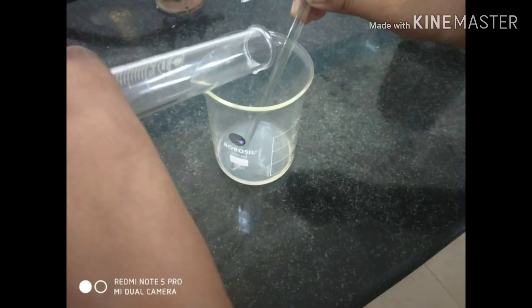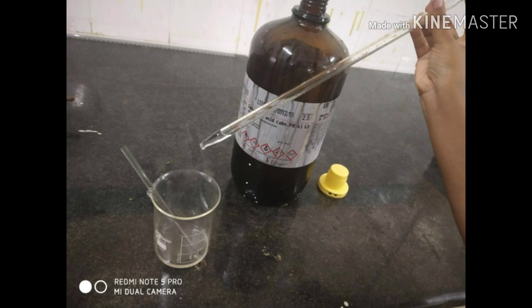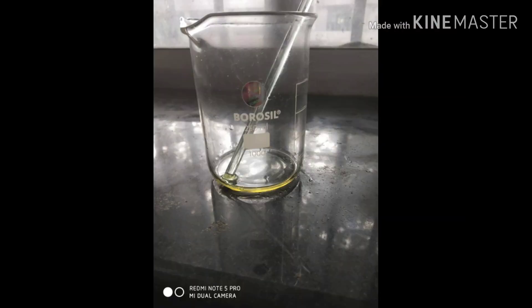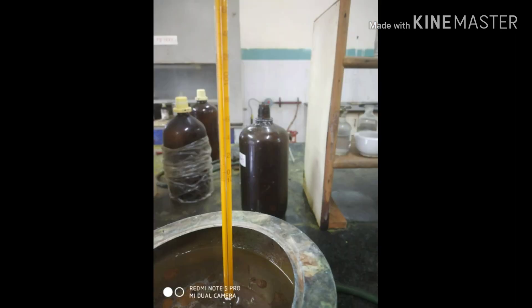Mix well. Add 0.1 ml of concentrated sulfuric acid dropwise and stir well. After the completion of stirring, it is kept in a hot water bath for 10 to 15 minutes maintained at 60 degrees Celsius.